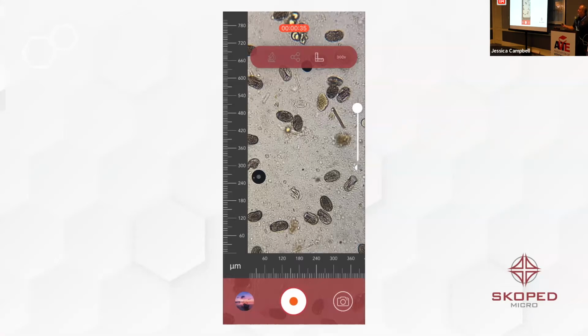And so this is looking at the app, and we've got a couple things up here. About 26 months ago, I was on a trip to Utah to talk with my future partners about different problems we could solve. And they told me, hey, if you think you can solve problems with software, we know people. So that got me to thinking. And so I had a meeting with the parasitologist and the pathologist that taught me at OSU. They granted me a meeting. I think at first they were just, whatever, Cade, come up and visit with us, but quickly realized that I was actually on to something.